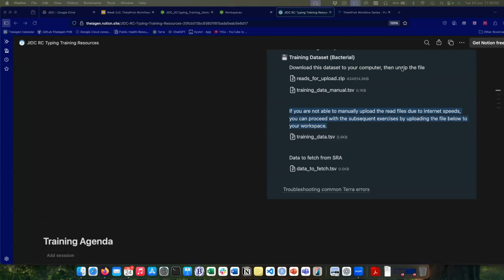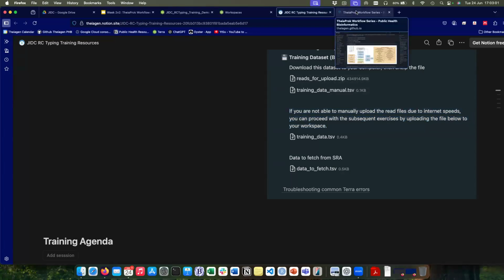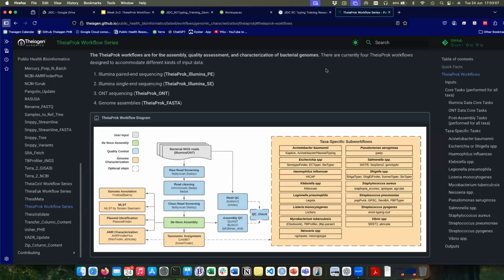Yes, Alam. Thanks, James. It's a follow-up question on my earlier question about using the contigs. If we will be doing that, we'll need to upload the contigs, right? So in the first step, when we uploaded the reads last time, we'll have to upload the contigs. Do we follow the same steps like the manual upload, but instead of uploading the reads, we upload the contigs? Yes, so instead of uploading FASTQ files this time, you just upload FASTA files. Okay, same process. Yeah.